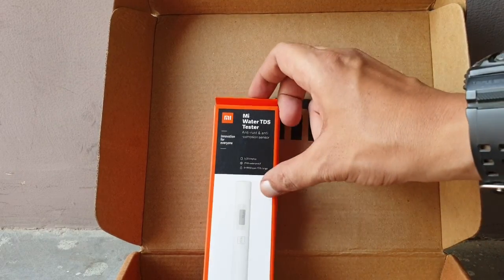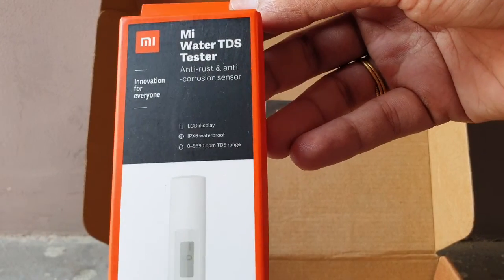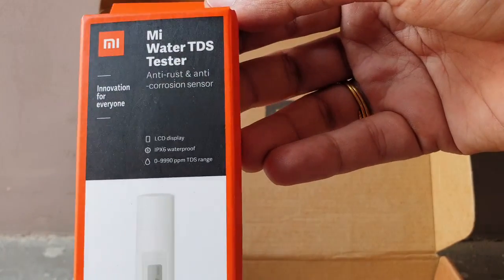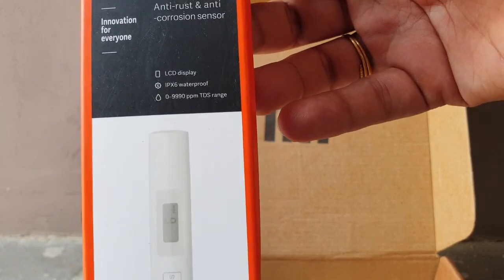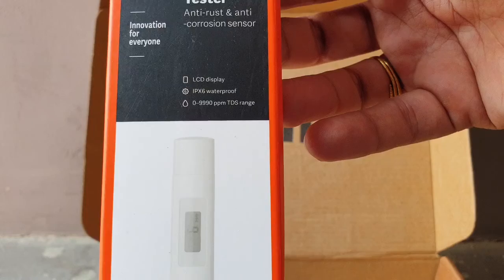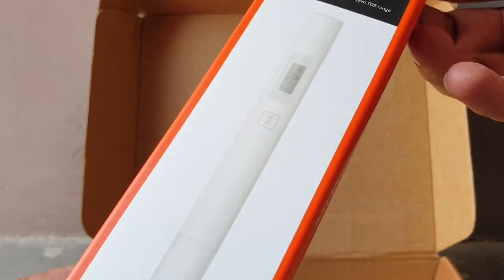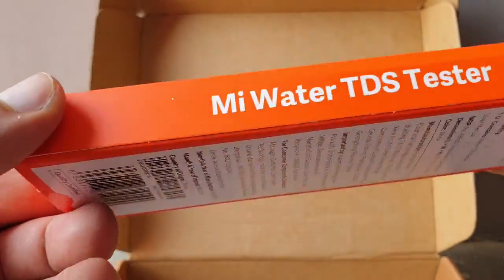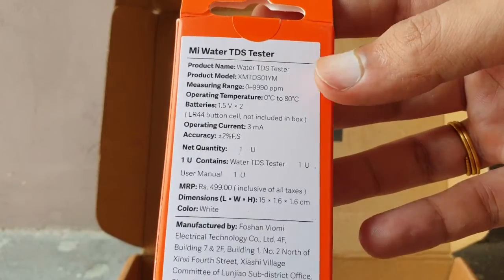Hello friends, today I have the MI Water TDS Tester — an innovation featuring an anti-rust and anti-corrosion sensor, LCD display, and IPX6 waterproof rating. It displays a TDS range of 0 to 9990 ppm.